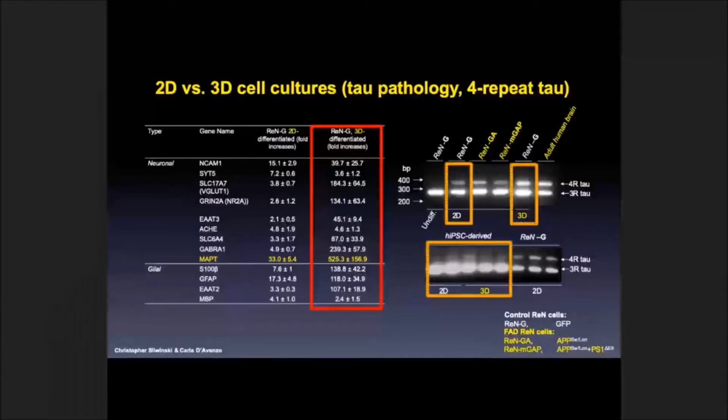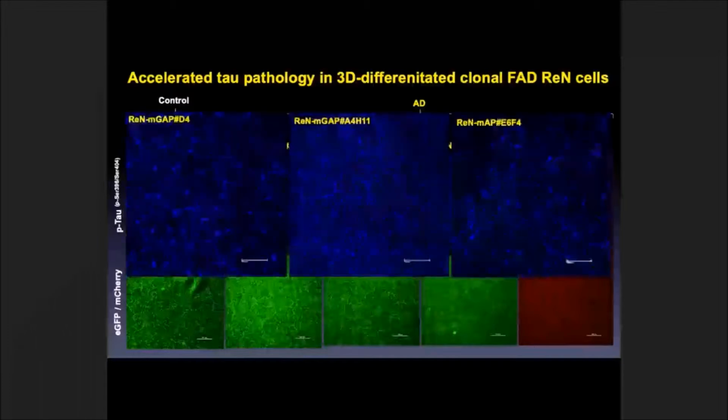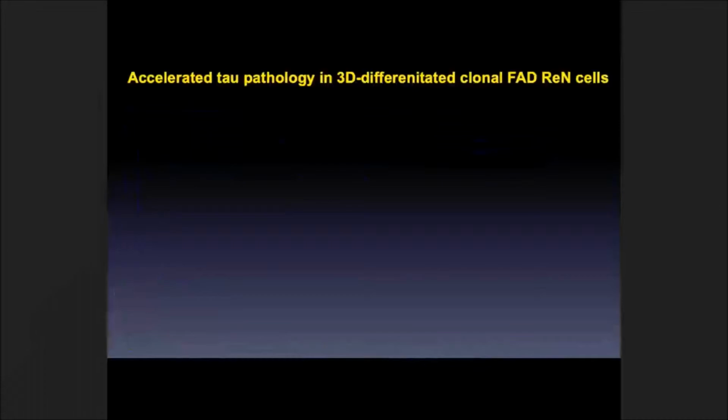And this is a tangle, and this is how you can see neurofibrillary tangles. We have antibodies against pathogenic hyperphosphorylated tau species, and this is the staining. You can see these are control cells, at really low magnification now, and you can see these AD cells have a robust increase of this staining. This is a high resolution, so you may appreciate a little bit that the accumulation is in the cell body and neurites. Resolution is not that great. Maybe I can go to these pictures.